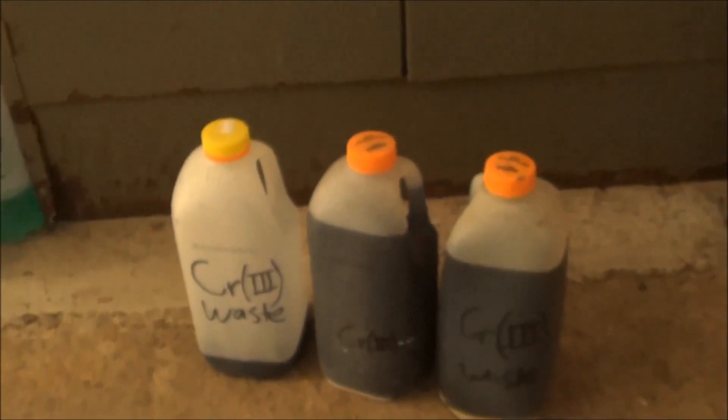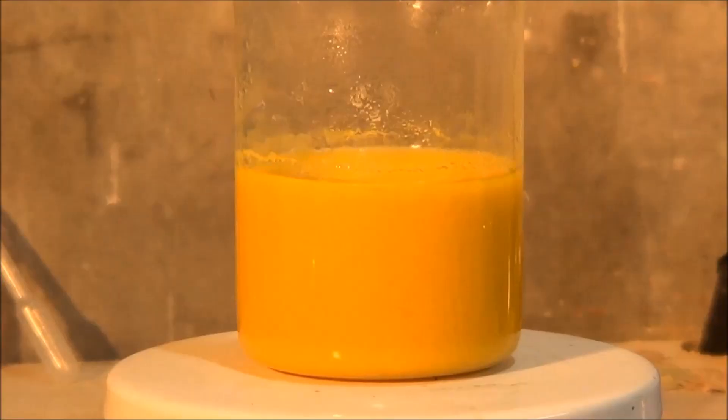I mean, I've got a few other wastes here, I've got nickel, cobalt, copper, stuff containing isopropanol. So, you know, I just have them hanging around.